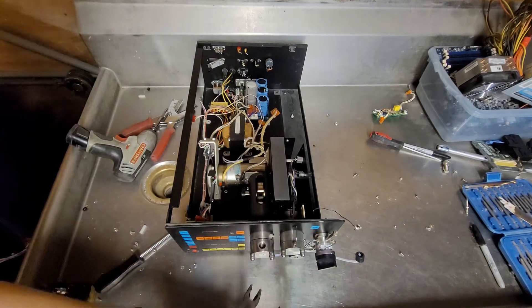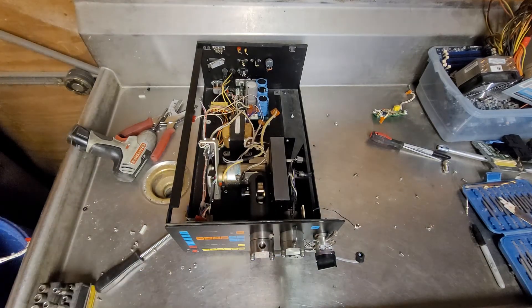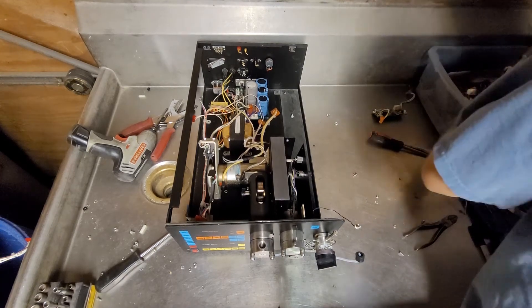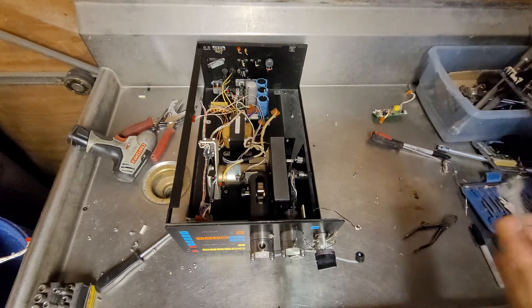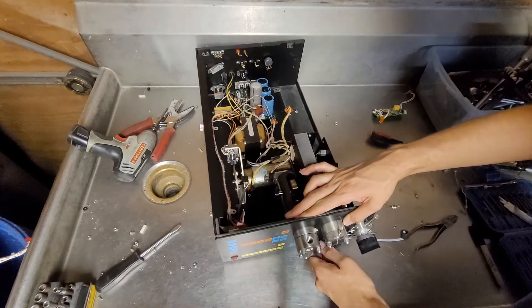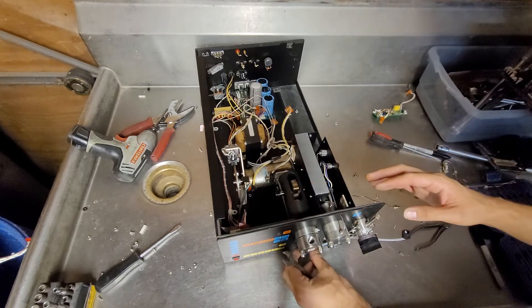I might need a wrench for that. Let's see if I have something here. Oh look at that, it fits. A little pressure release there.